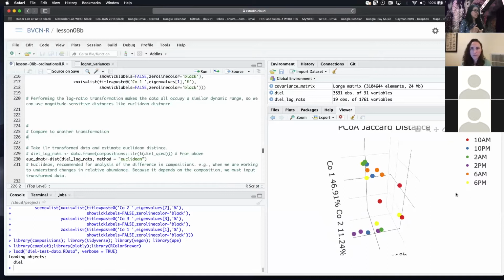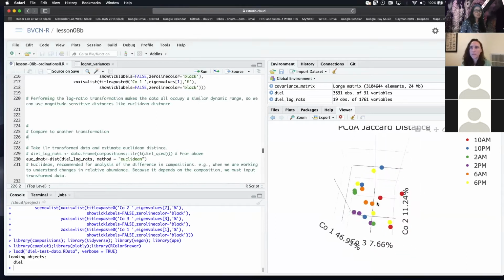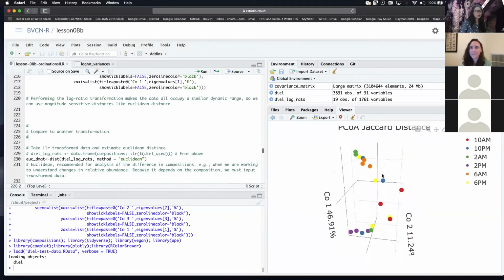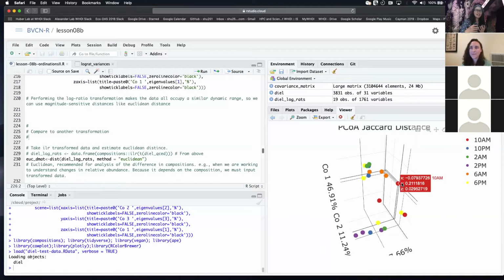So today we're going to go over one more transformation, and then I'm going to talk about forcing some of this data into 2 dimensions, because I personally would prefer to not publish with this in the main text. I have used this Plotly output in an HTML format, and then been able to share that HTML file with someone, and then they can interact with the data like I am here, which is really fun. But I think that 2 dimensions is a little more effective sometimes on a single page.